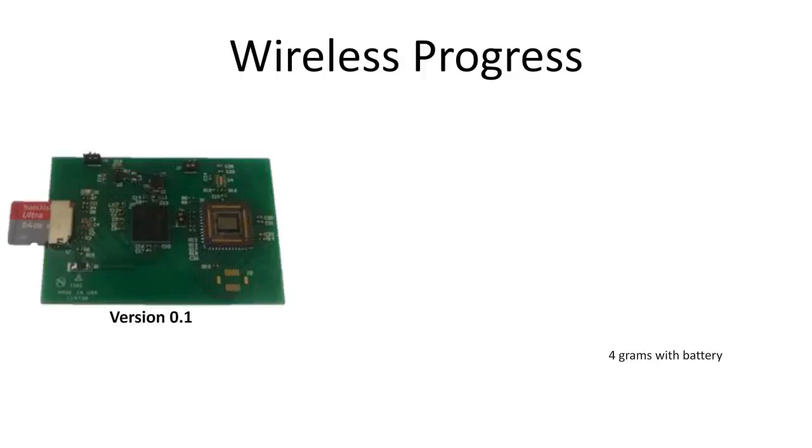I'd like to talk to you a little bit about our wireless microscope. So we wanted to improve the microscopes that we currently have, so that one thing is to get rid of the wire. Because when animals are tethered by a wire, you're always limited by how far they can travel. Also, another key thing is that the wire may tug on the animal a little bit and alter the way it behaves on common tasks. For example, we've discovered that in social behaviors, the behaviors are not quite the same when the animal is tethered by a wire. So we wanted to get rid of this wire so that we could test the animals in very large environments, very complex environments, including tunnels where these wires would not work.